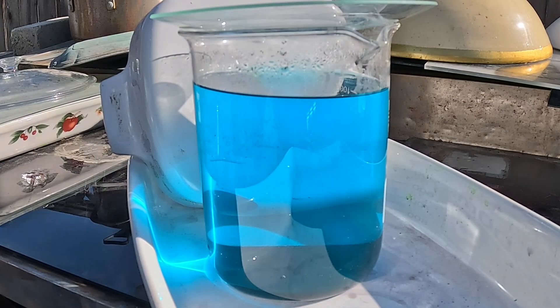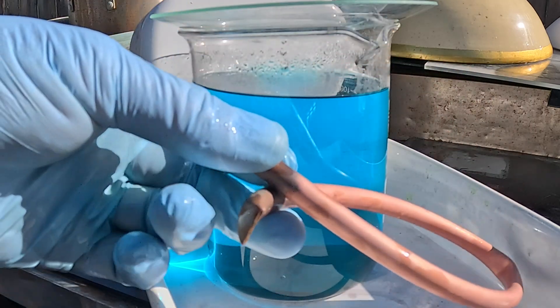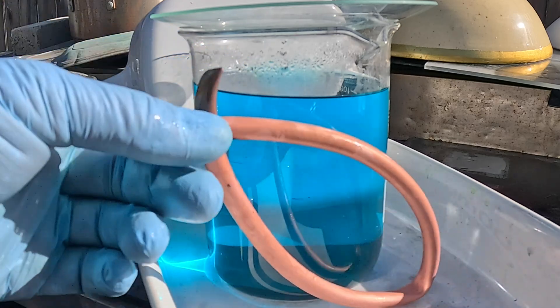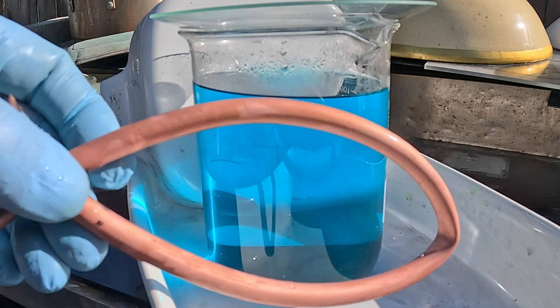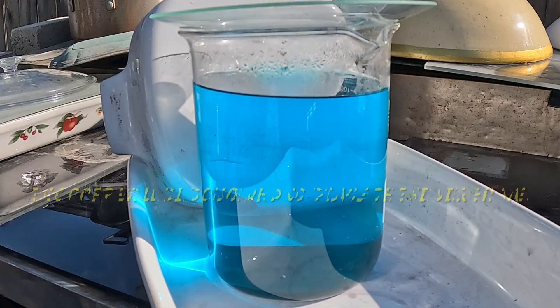I've got a beautiful silver nitrate solution here, well filtered, and a nice piece of copper — kind of gnarly. I cleaned it real well. The copper-looking part was cleaned with hydrochloric acid then washed good in water, that's why it's a little bit wet.